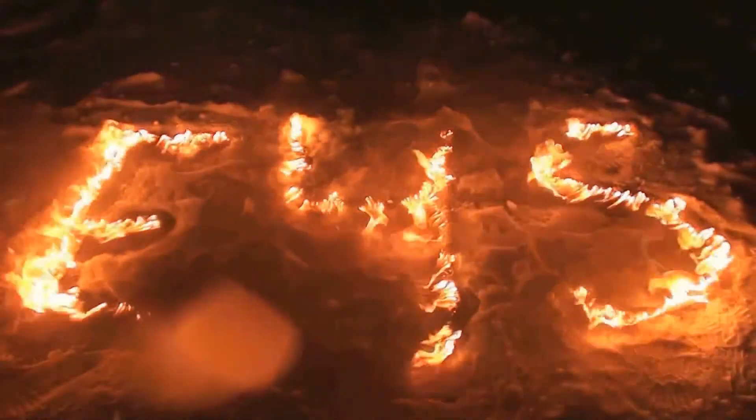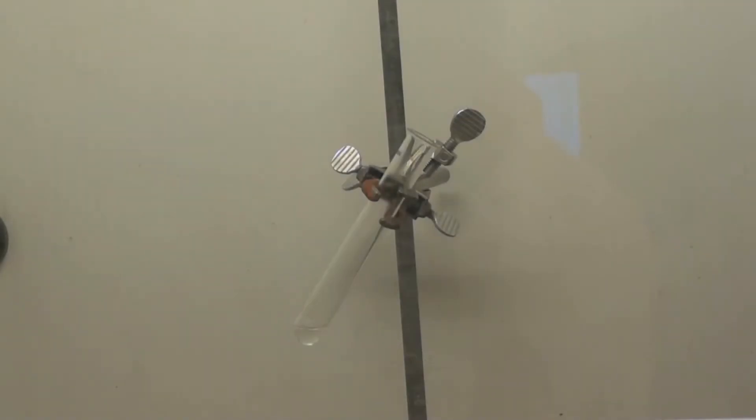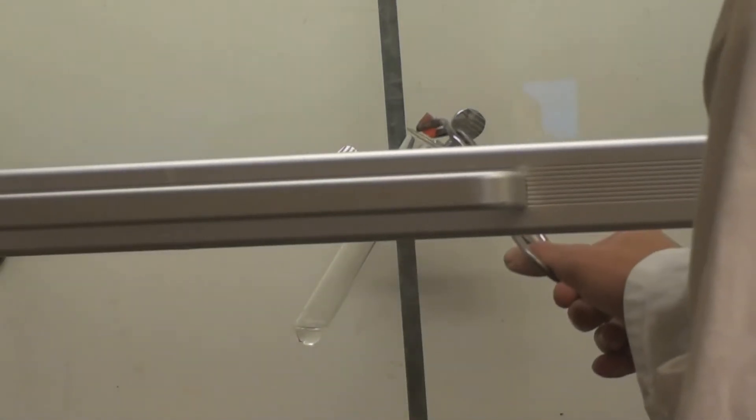Welcome to Eye4Science. Greetings viewers! Today we're going to make a short episode about flaming gummy bears.